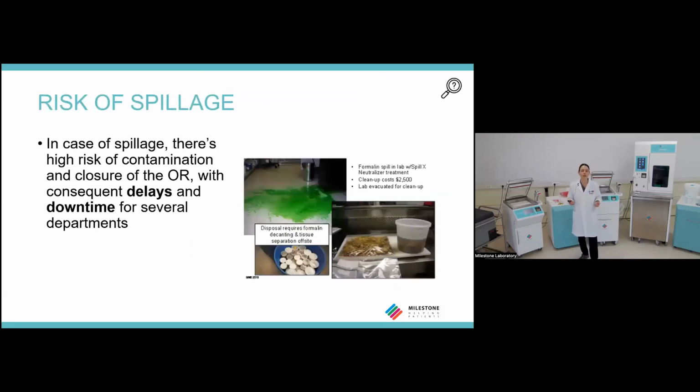In the operative theater, if right now the procedure is manual, we are not robots, we are human, so an error can happen. If we manually fill plastic containers with formalin, something can go on the floor. But as you know, if there is a big spillage of formalin in the OR, the OR will be closed to be sanitized and so on. But you can understand the damage to the OR, because if you have many planned operations for that day, this is really not acceptable.